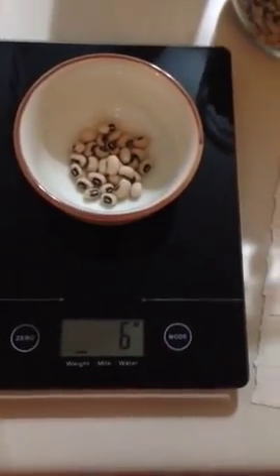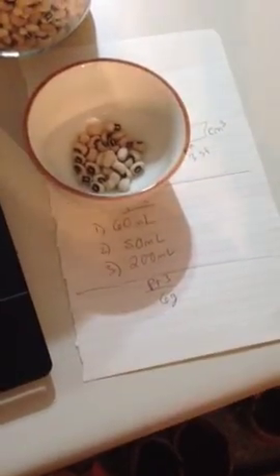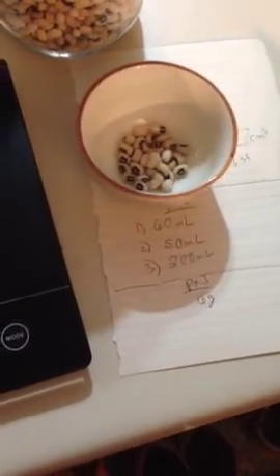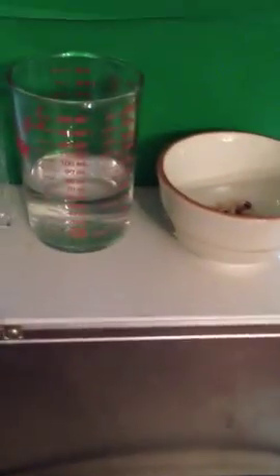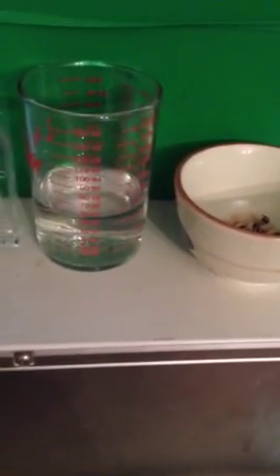It would be great if you could find a scale that gave you more precision than that, but this is what I have, so maybe that's what you'll end up with too. And now that we've noted down the mass of our black-eyed peas, that's 6 grams, you're going to take this very sample and add it to a measuring device with liquid in it. So this technique is called water displacement.